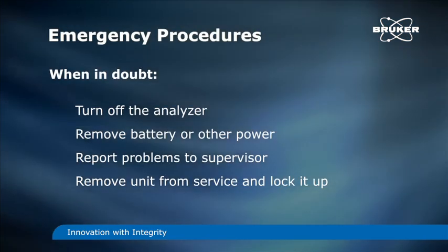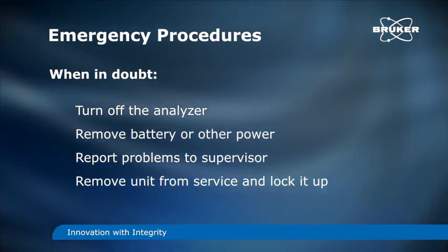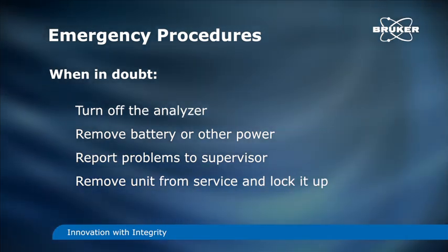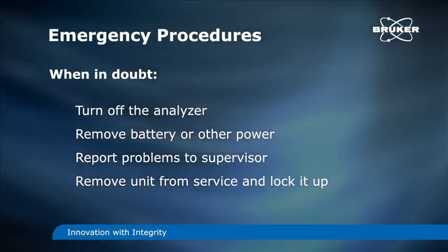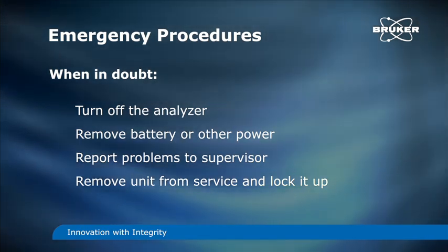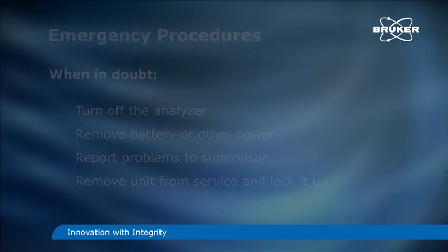In cases of emergency, if there's any doubt about the operation of the analyzer or the safety of the source, immediately remove the power source. This can be either the battery or the line power supply. If there's no power to the tube, there will be no radiation generated.